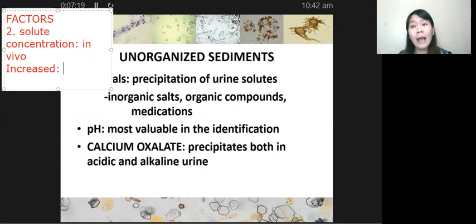Okay. Yan nga yung principle ng saturation. Diba? Saturation of a particular solution, saturation, oversaturation or supersaturation of your solution. So, kailangan lagyan mo siya ng lagyan ng maraming solutes para mag-crystallize. Diba?